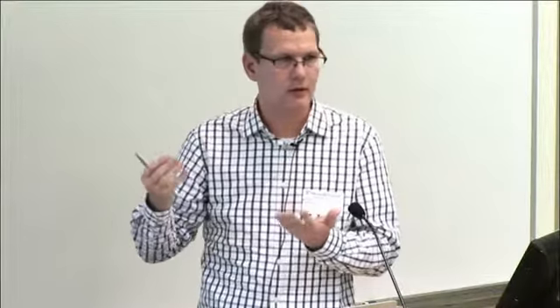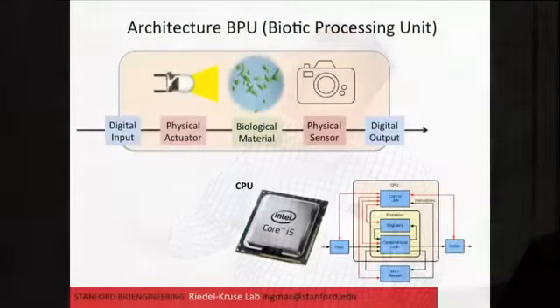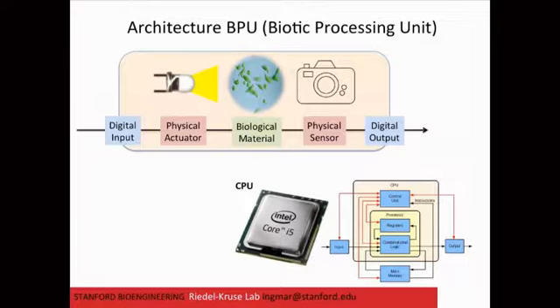You can think about interactive biology where you don't have that, but as you saw, if you want to build cloud labs or whatever, we eventually need to interface with these digital infrastructures that we are so heavily used to, right? If you connect something to this digital realm, you can draw a close comparison to other chips that we know, CPUs, GPUs, and so forth, where you have an input, and then something magically happens and gives some digital output. The same thing happens here, except there's a biological process in the middle that is noisy and has other properties. For that reason, we call this setup a Biotic Processing Unit, or BPU.